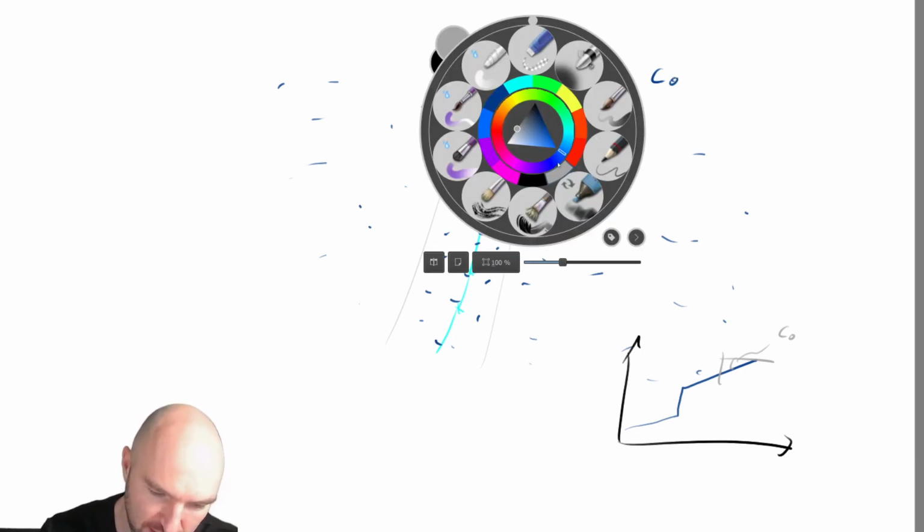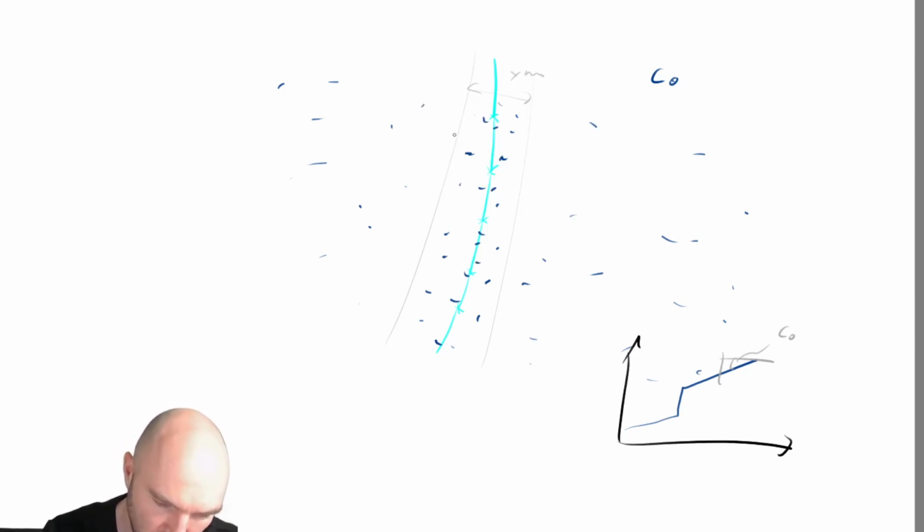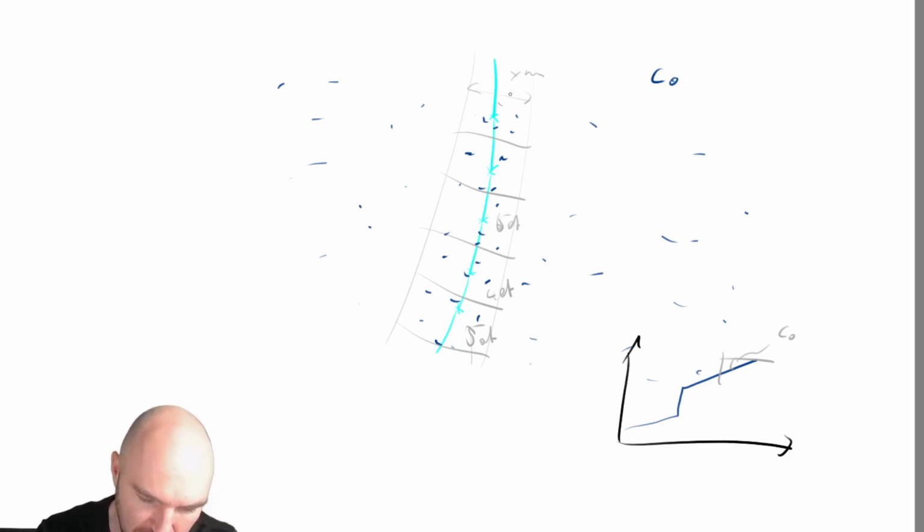And what we've done then is the Voronoi decomposition, just like we've mentioned before. So we've subdivided that here and just calculated how many atoms we have in each box. In this case, it would be 5 atoms. In this case, it would be 4 atoms. And in this case, it would be 1, 2, 3, 4, 5, 6 atoms, and so on and so forth.